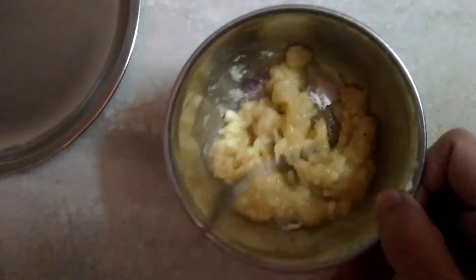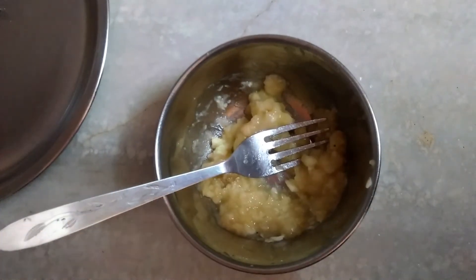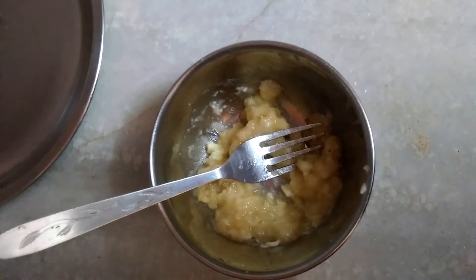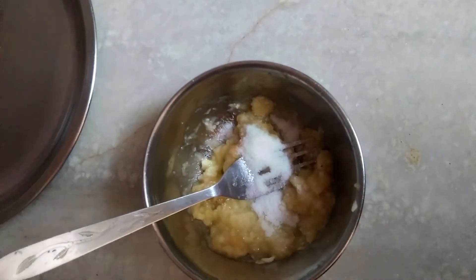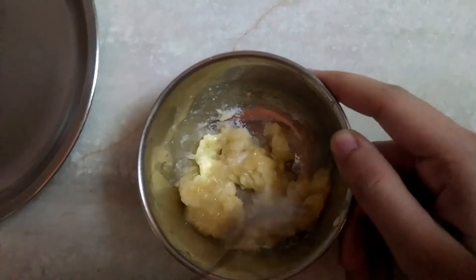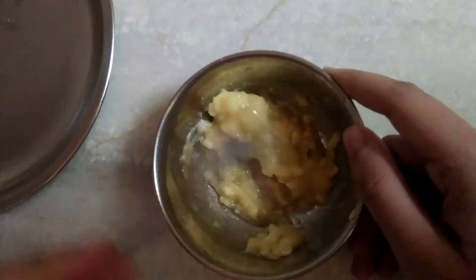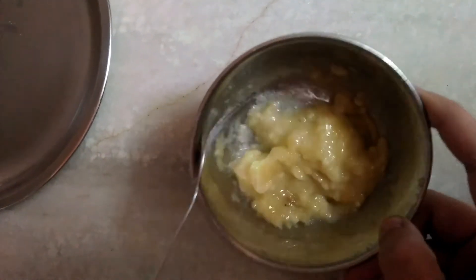Add 1 tablespoon of salt to it. Now mix it well. Now we have got this paste.